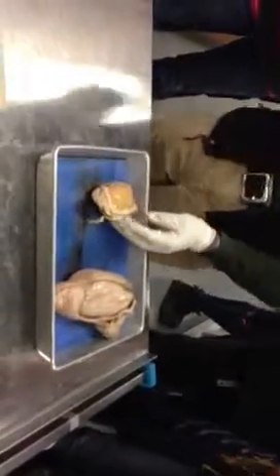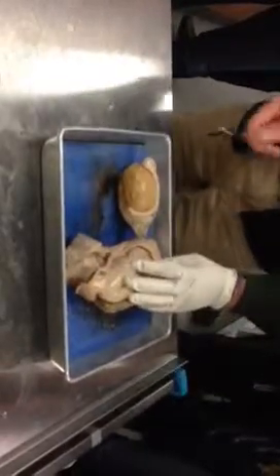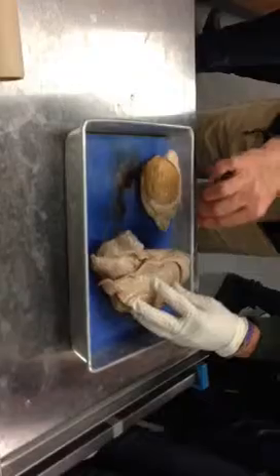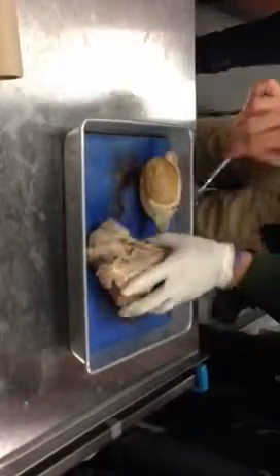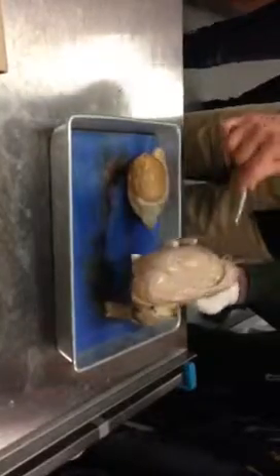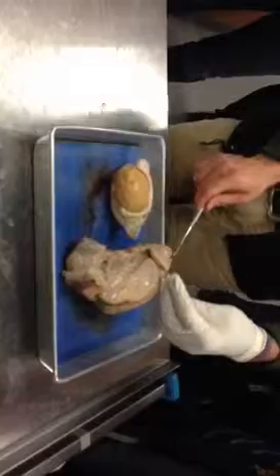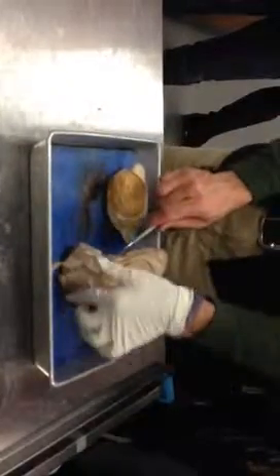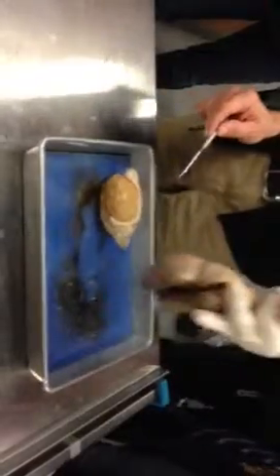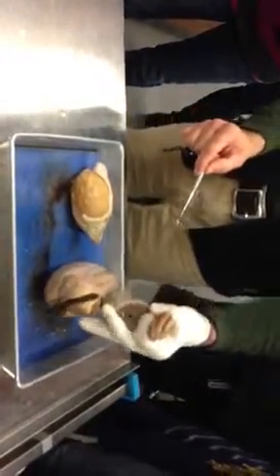Okay, so quick review. I'll leave this out. You can look at it or use the probe on your own if you care. Testis, epididymis along the side. Best way to see it is here. That's a nice view of the epididymis. Off the tail of the epididymis is the vas deferens. And typically the vas deferens would be together with the cremaster muscle in the spermatic cord. So all this stuff that I'm holding on to there would be spermatic cord.